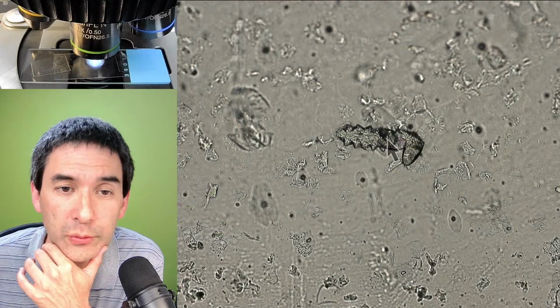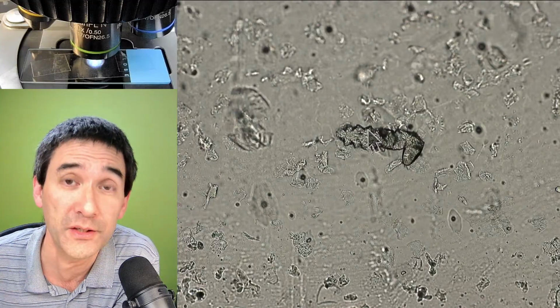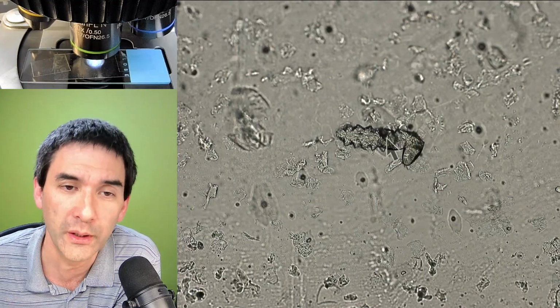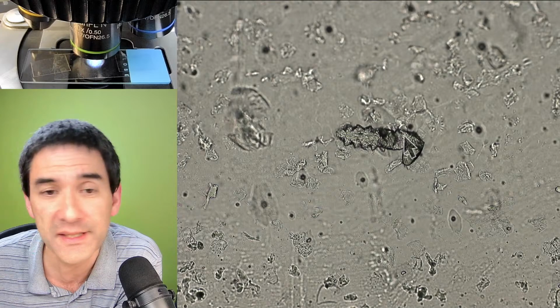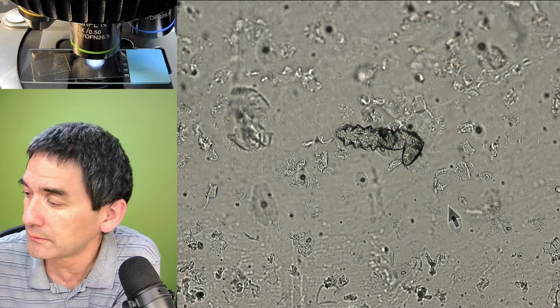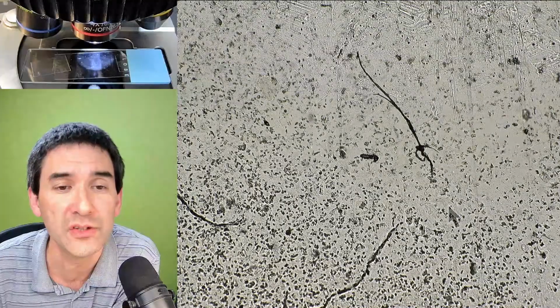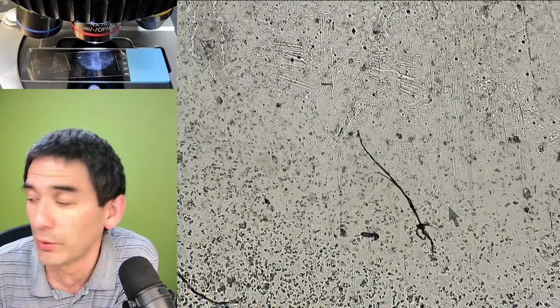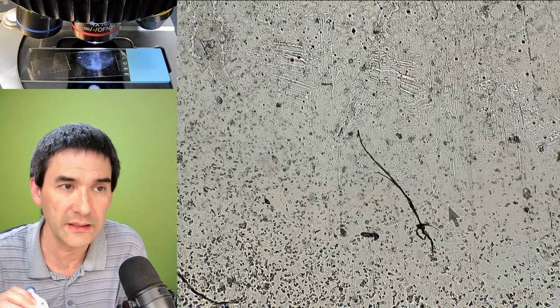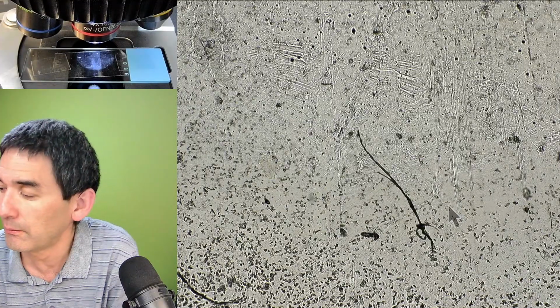Okay, how am I able to get it off? First of all, those face mites are hydrophobic, so they like oil. They're covered in oil, so I'm not able to get it off by adding water, so I have to add oil. And that's basically what I'll be doing now. This takes a lot of patience and a steady hand, and maybe I'm going to be successful or not, I don't know, but at least you get the idea. So what I'm going to do now is take a little bit of oil and add a small drop of oil on top here.